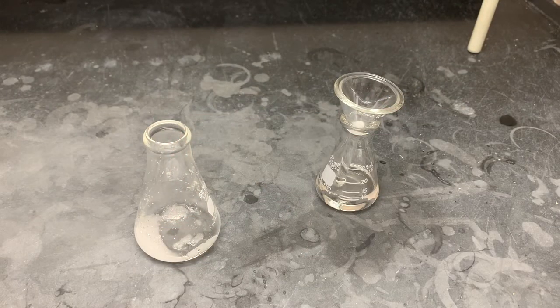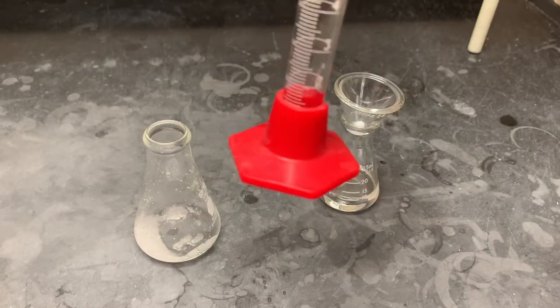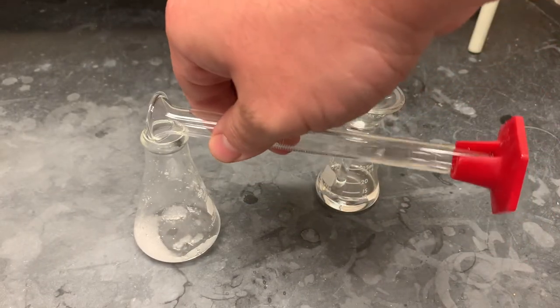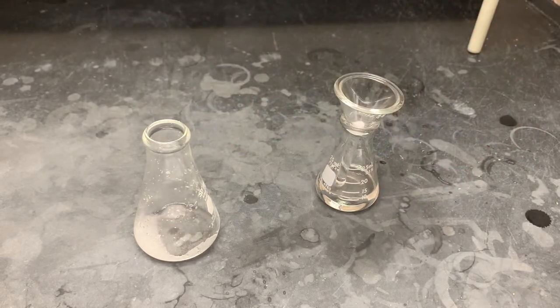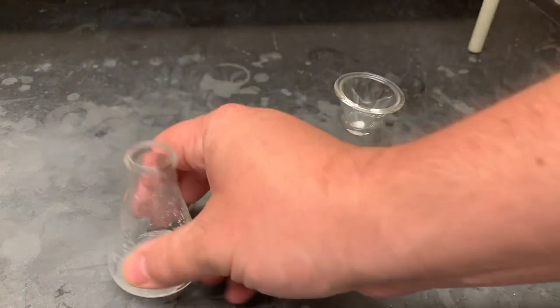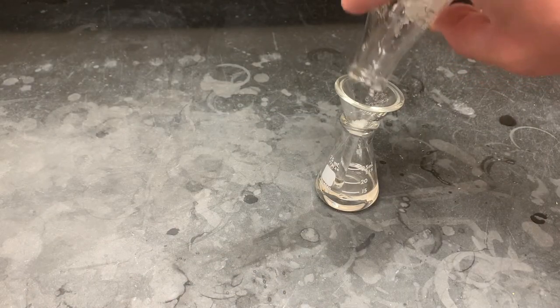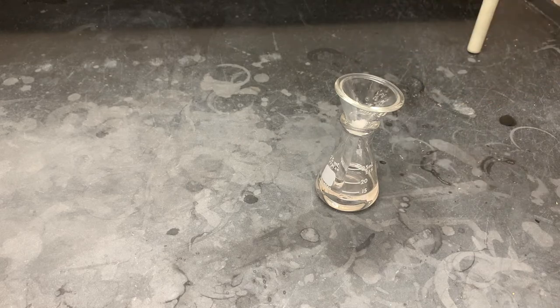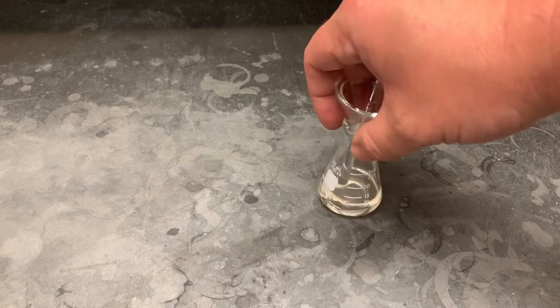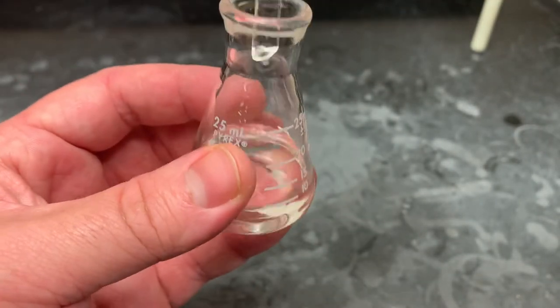Now there's always some left over, so we want to grab whatever solvent we were using. We only need a couple mLs. We're going to add that back in just to rinse that drying agent and get what's left on it. Yeah, crisp, clear, nice, dry solution.